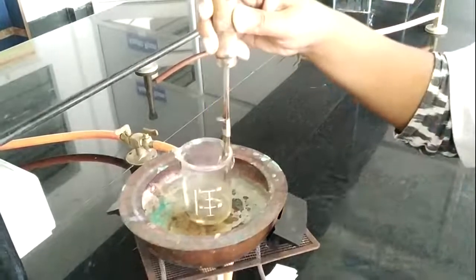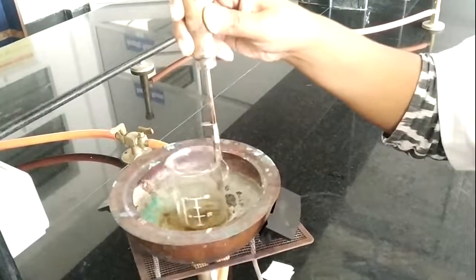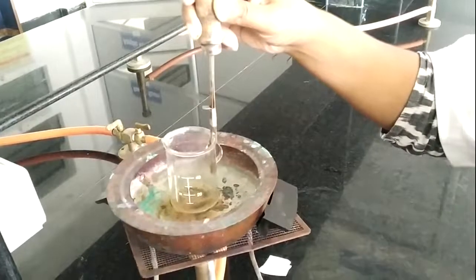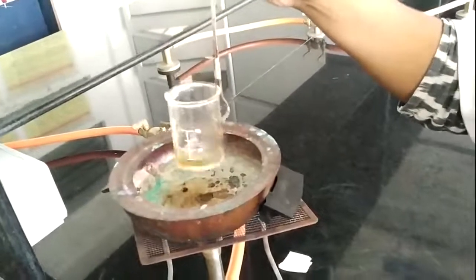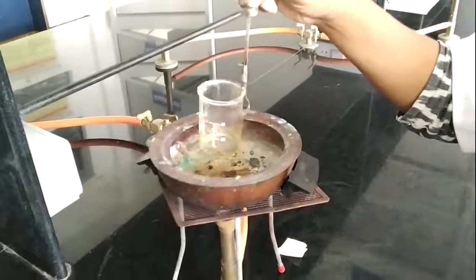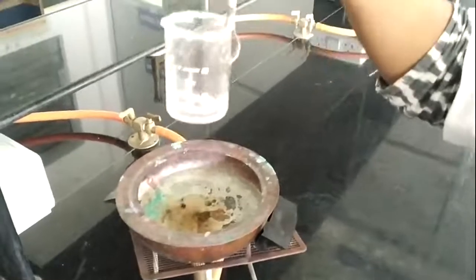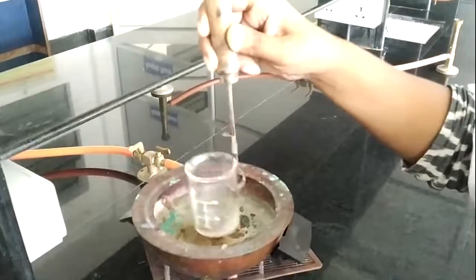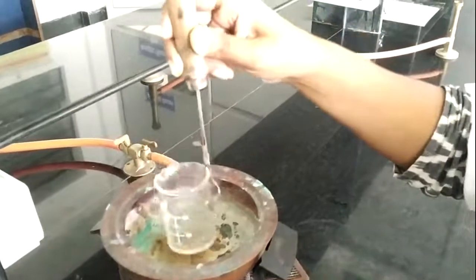So I am going to add the yellow soft paraffin into it. Previously, we will wait till the temperature reaches 40 degrees Celsius. So we will wait for a few minutes, and after that I am going to add the yellow soft paraffin into it. Let's see, all the brown color has disappeared. So now I am going to add this yellow soft paraffin into it, and then we will again proceed to mix it properly, as this melts.